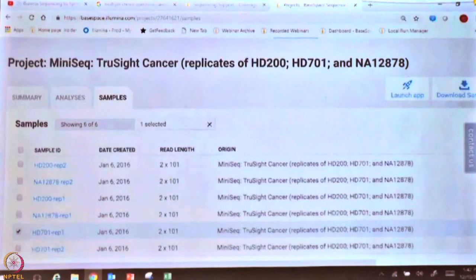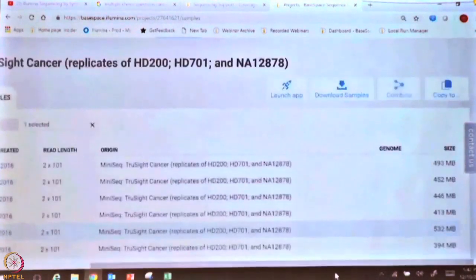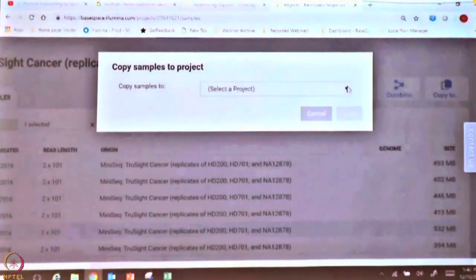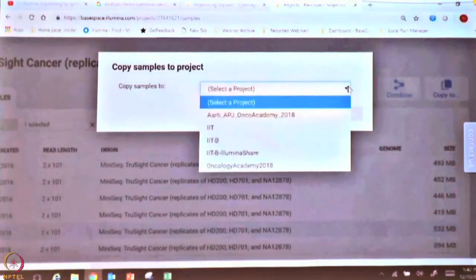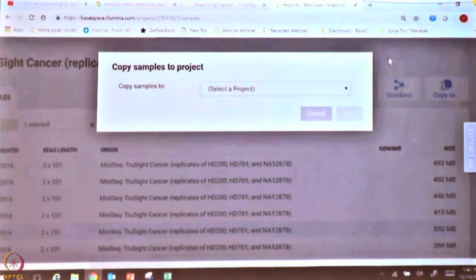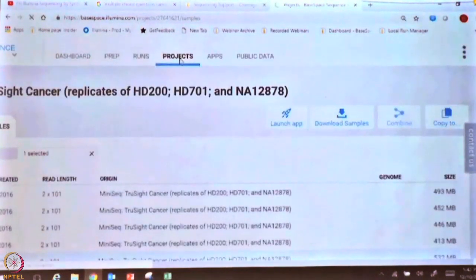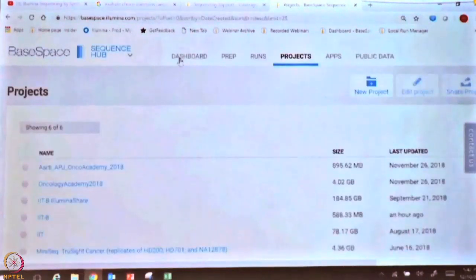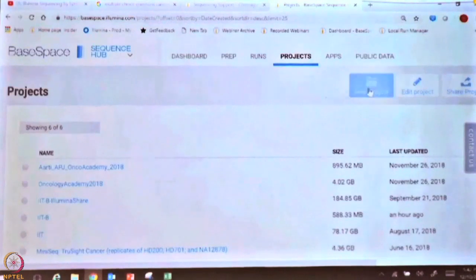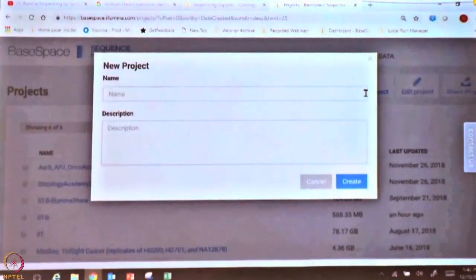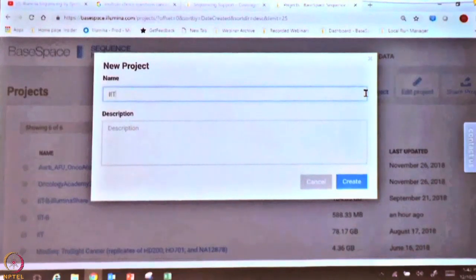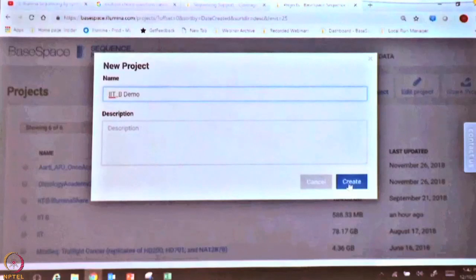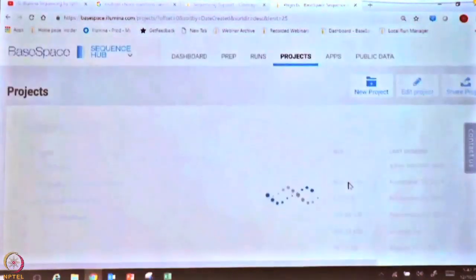Select this sample and copy it. But first, if you do not have a project yet, let us go back to projects and create one. Click on the projects section, then click the new project file icon and give a name to the project. For example, I am going to call this IITB demo. Once you have created the project, go back to the dashboard.